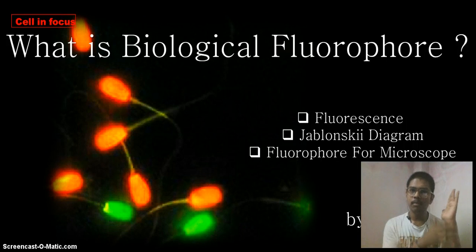Okay, so step one is the excitation, and it can be anything, from the initial state, that is the ground state, to the first excited state, second excited state, third excited state. It can be anything. But whenever you are coming back, that is de-excitation. De-excitation happens in two steps. Whatever your position is, second, third, fourth, you have to first come back to the first floor. That is the first step of de-excitation. It's called relaxation. And then you have to come back to the ground floor, and that is called emission.